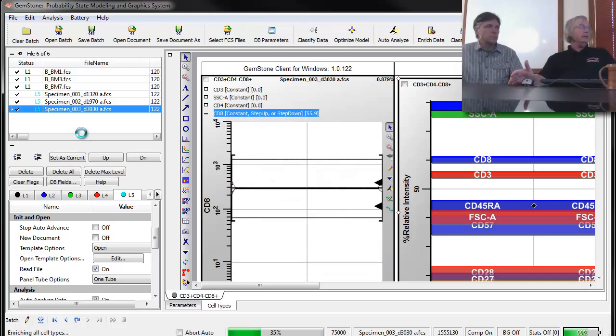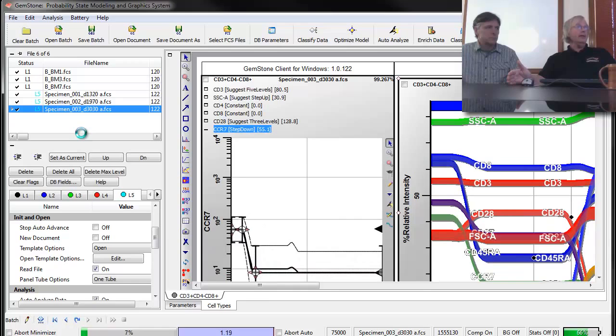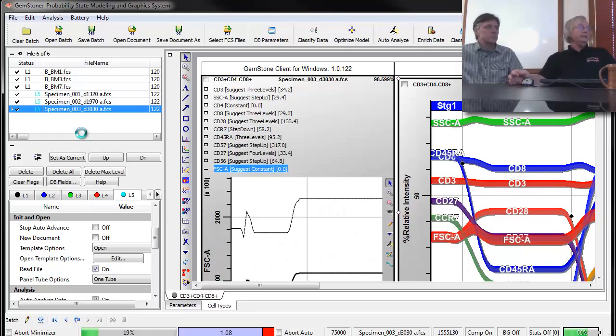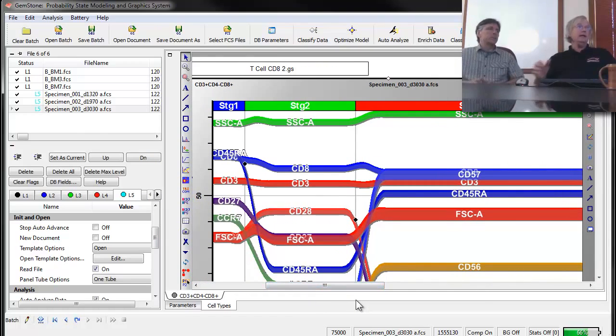So it's going through its selection. It's automatically doing an enriching at this point. And now it goes through and it starts stratifying the data. It's doing its final fit, and we're done. And you can nicely see, Ben, that these percentages actually can dramatically change from person to person. Yep. Stage 1 is the naive stage, and you can see that in this particular donor it's actually quite small relative to the other ones.